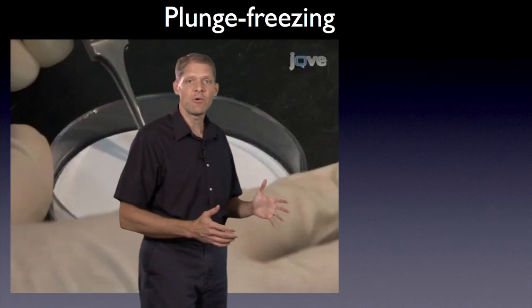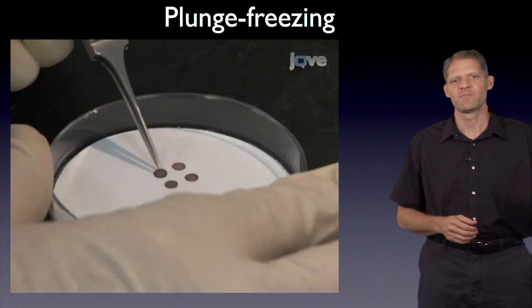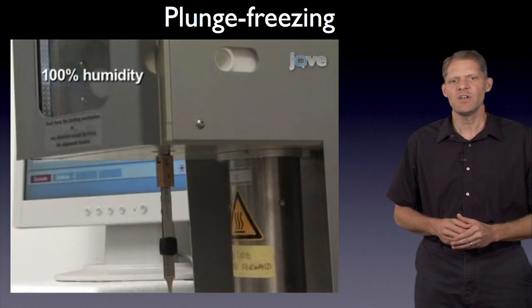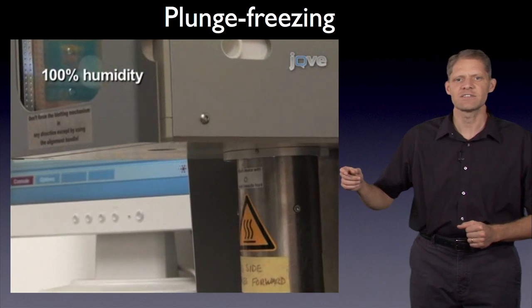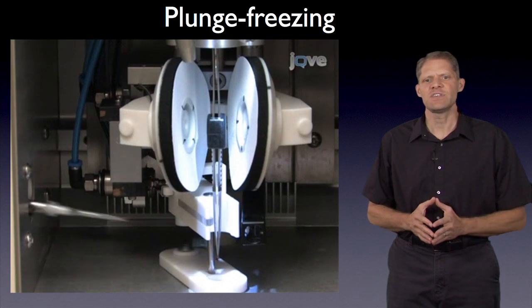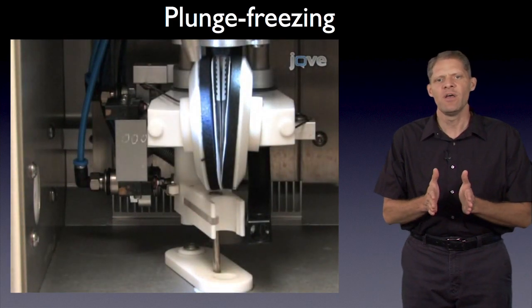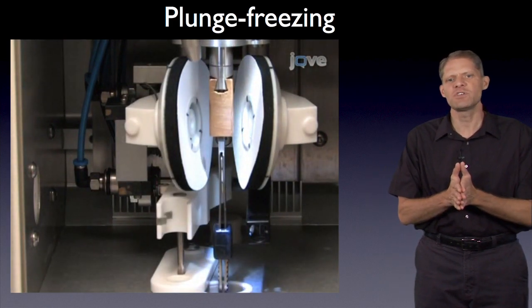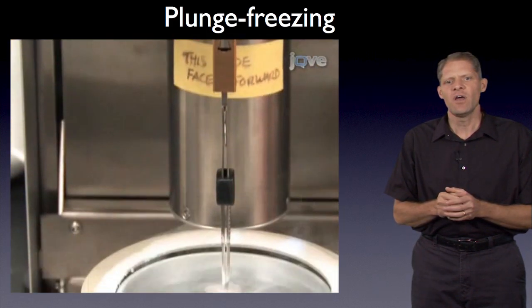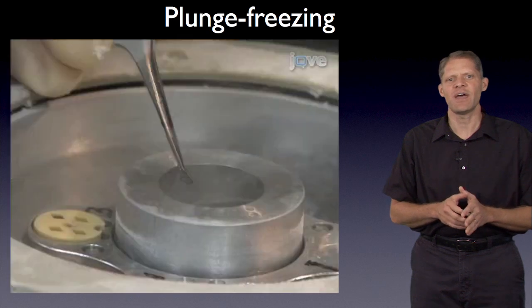Now I'll show a movie that we recorded for the Journal of Visualized Experiments showing this process of plunge freezing. First, individual EM grids are loaded into an automatic freezing device. And so here the sample is being applied. A couple microliters of the sample is applied to the EM grid, and then it's lifted up in between two pads of filter paper. Those pads press against the grid, absorbing most of the material, and then the grid is plunged into a reservoir of liquid ethane. There it is in the middle, and the ethane is surrounded by liquid nitrogen.